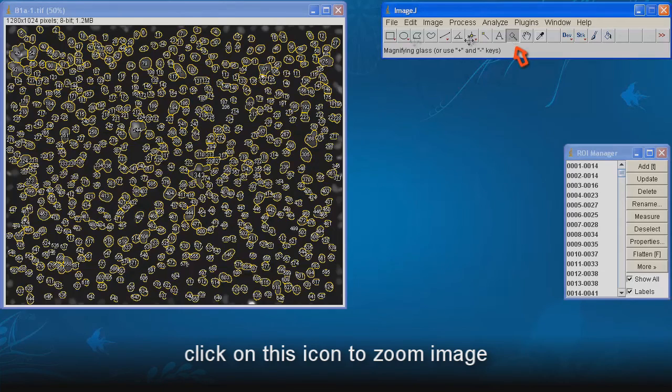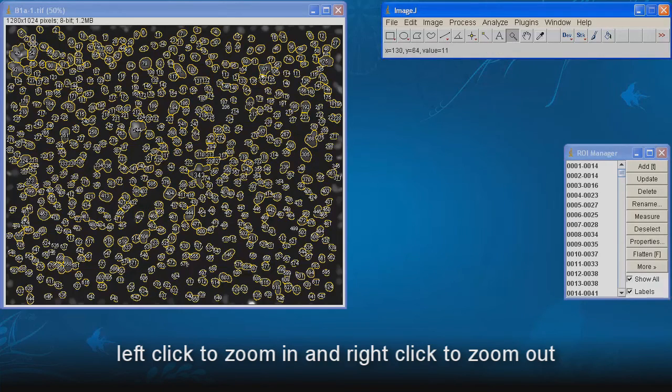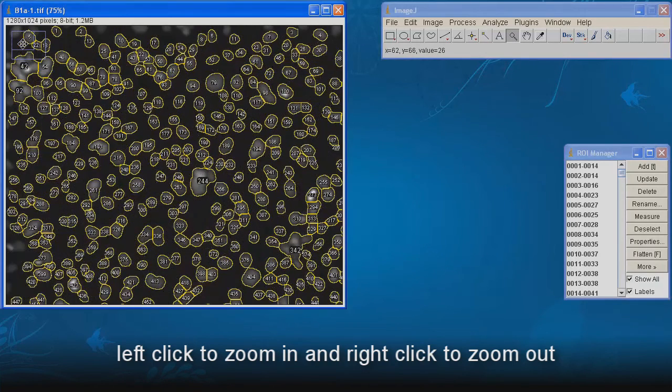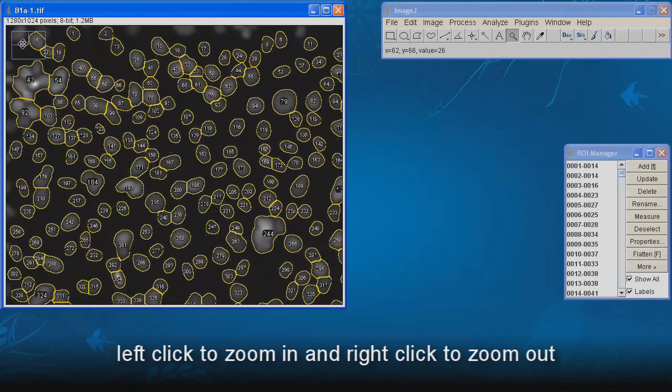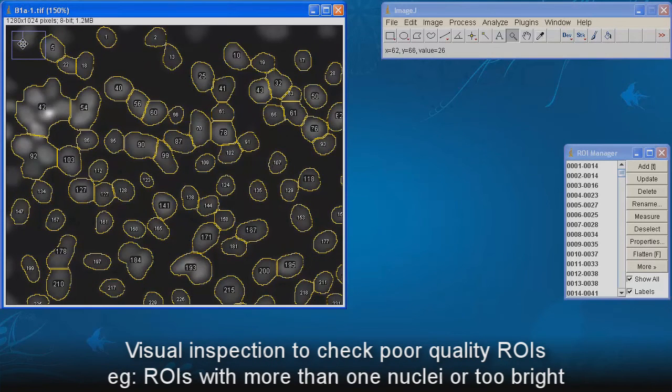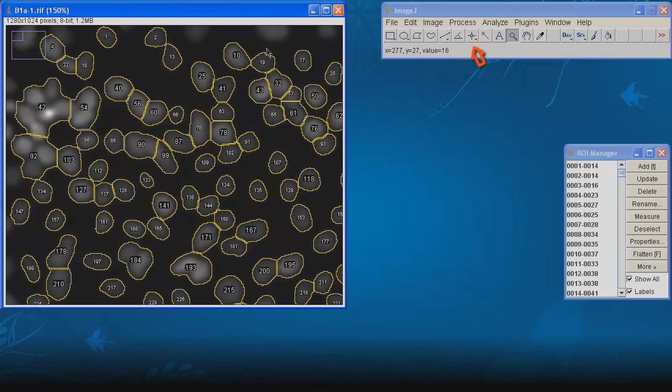Click on this icon to zoom image. Left click to zoom in, and right click to zoom out. Visual inspection to check poor quality ROI.